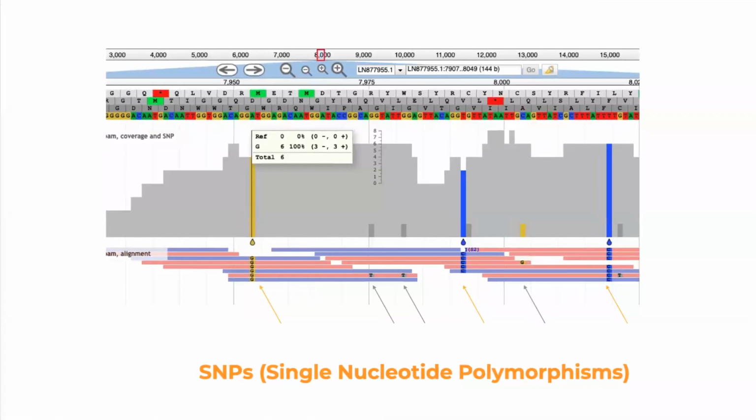Okay, so as you remember, last time we aligned reads onto the reference genome. So let's review what we are actually seeing in this visualization from last time. We have the reference genome right here at the nucleotide level, and we have 3 different versions of how this nucleotide sequence converts to codon sequences or amino acid sequences. So you can see, depending on the reading frame, 3 different options.